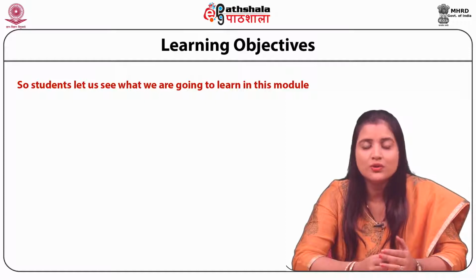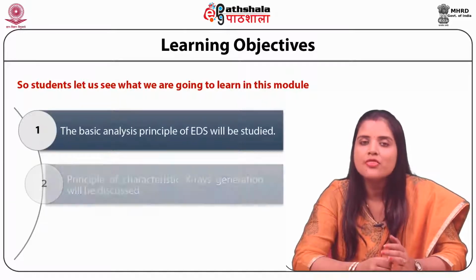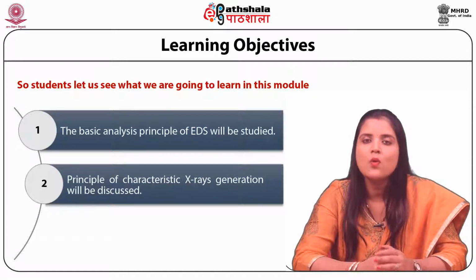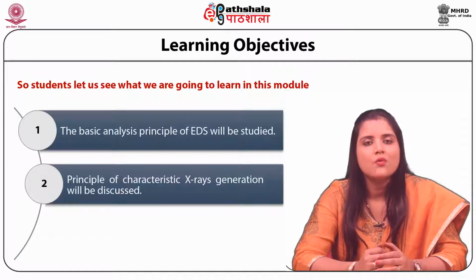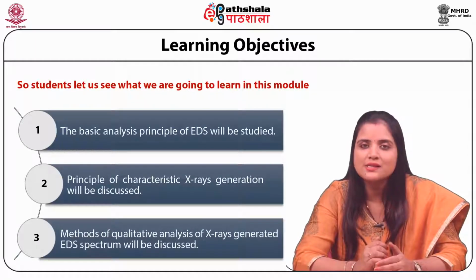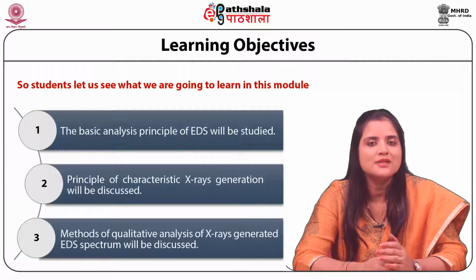In this module, the basic analysis principles of EDS will be studied. Secondly, the principle of characteristic X-rays generation will be discussed. Then, the methods of qualitative analysis of X-rays generated EDS spectrum will be discussed.